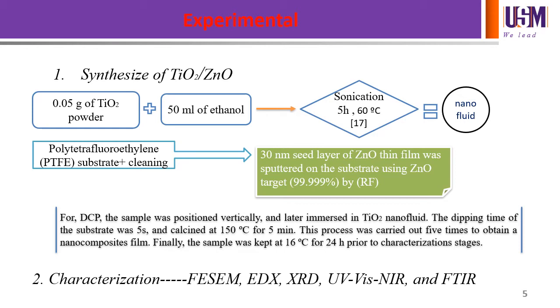The substrate was cut into 1 centimeter square dimension and it was cleaned in isopropyl alcohol under sonication, then washed by deionized water.